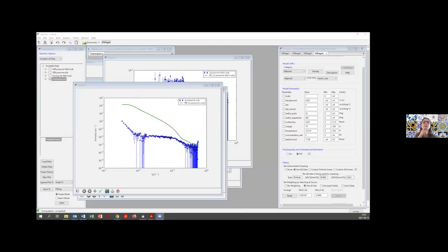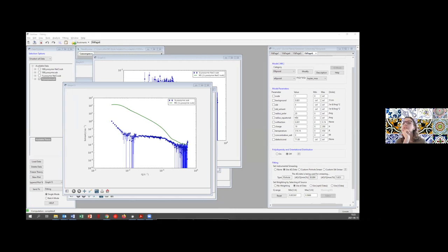I have a question also about this. In the tutorial, it says that we're supposed to change the structure factor mode to P times beta. How do I do that, because I also have version 4 of SASView? Okay, do you want to share your screen so I can see what you're seeing? Yeah, sure. It's possible that it's not in there. In the tutorial, it looks like there's a scroll-down menu here. Which version? This is 4.2.2. Let me check. It may not have the beta approximation.